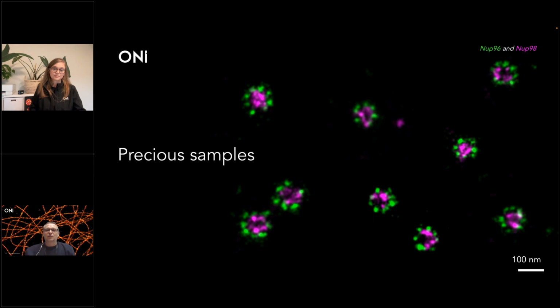You will be able to identify whether you have more receptors per surface, let's say in a treated cell or untreated cell. So that's what is different about this technology. It gives you spatial information of the protein. Flow cytometry gives you an overview of the protein. Is it there or not? Pretty much the answer is yes or no.